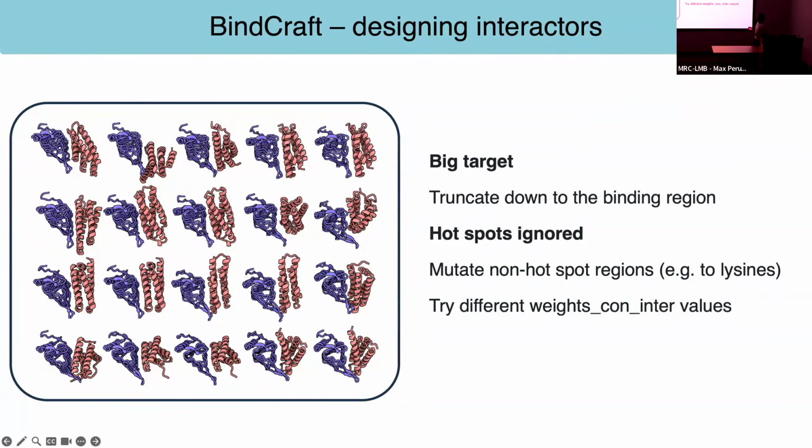And really then it's up to you to purify these things and test the affinities and use all of the things that you've learned throughout the seminars in the biophysics seminar series. Okay. Yeah, I mean, I should mention also that there's RF diffusion. This is another way of designing binders. It's not as nicely implemented, so people haven't been using it as much, but it's also very powerful, very nice way of designing binders.